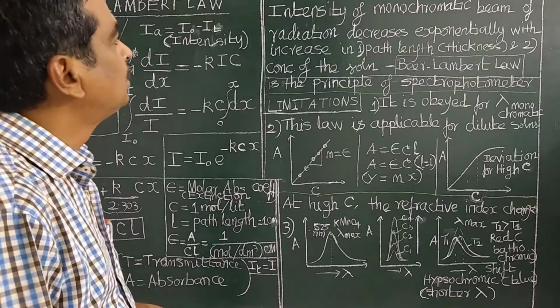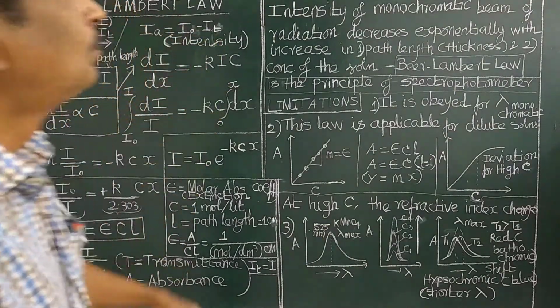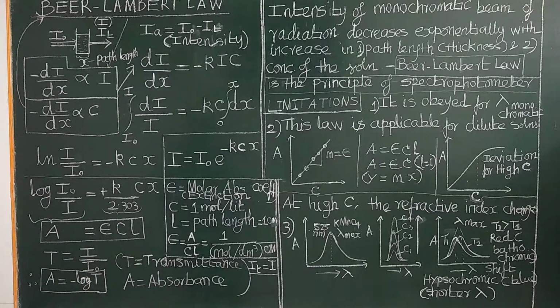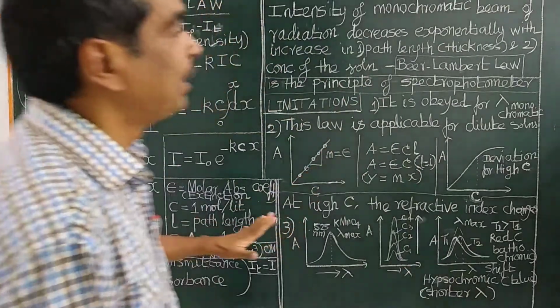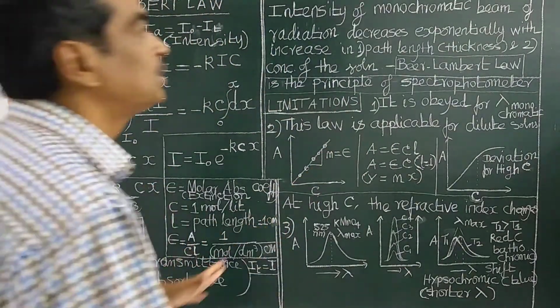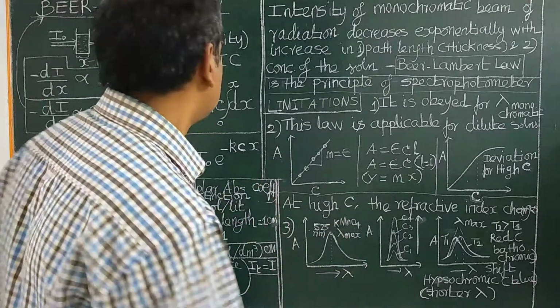Good morning. Today we will study Beer-Lambert's law. What is Beer-Lambert's law? It is the basis of the spectrophotometer, the UV-visible spectrophotometer, UV-visible spectroscopy, and absorption spectroscopy.